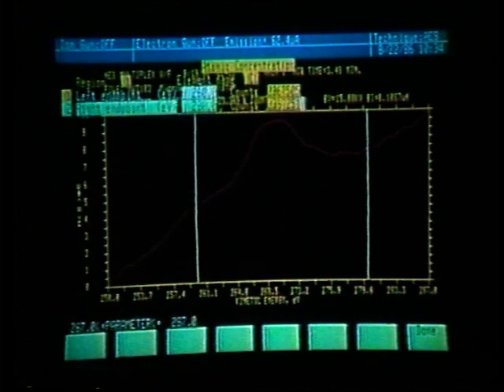Once again, we have already evaluated the carbon peak and determined that we did not need to define endpoints. But if we did need to define endpoints, this would be the method and the menu that we would use.